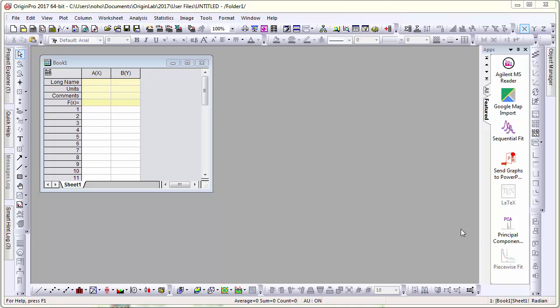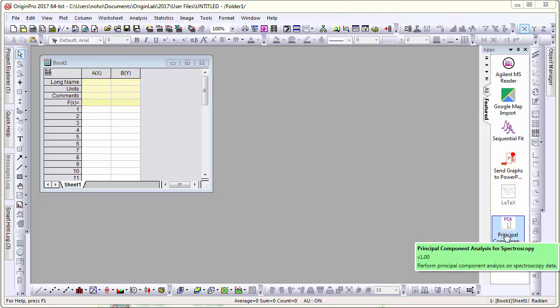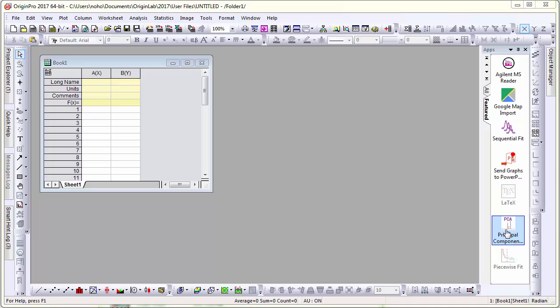In this video, we'll take a quick look at the principal component analysis for spectroscopy app. I have the app already installed.